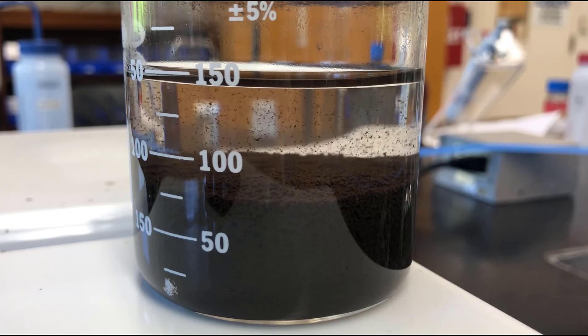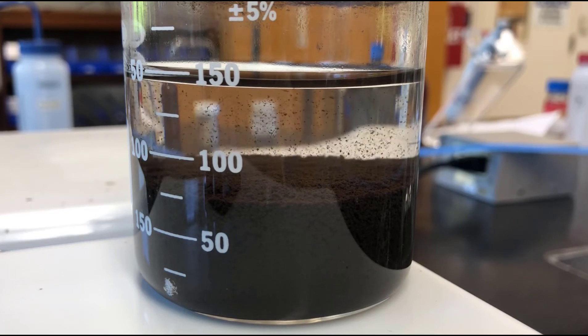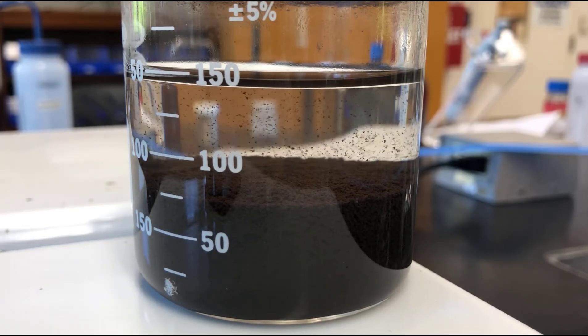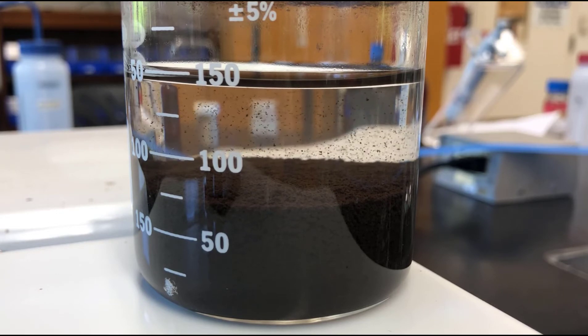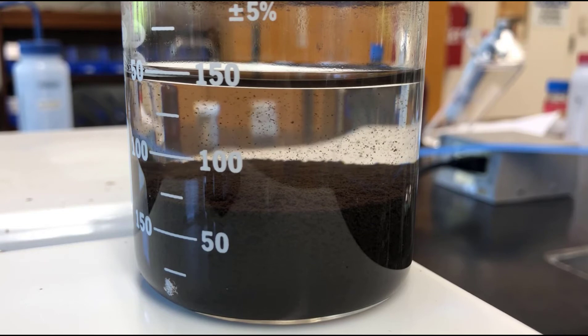Those larger crystals, because of their increased mass, will settle out faster in solution, and then you get a clearer solution above the precipitate when you do that. We'll let this go for a little bit, and once it's done we'll go ahead and decant this and then continue on with the next step.